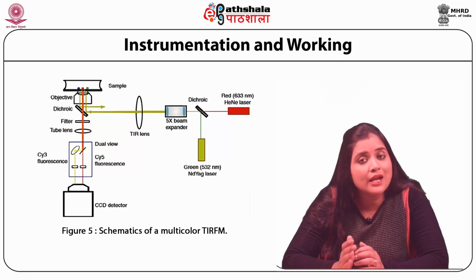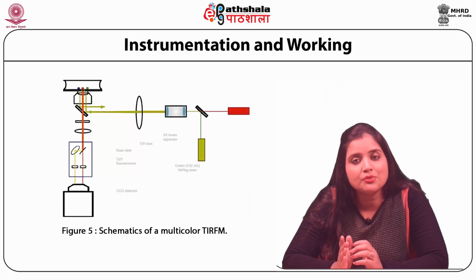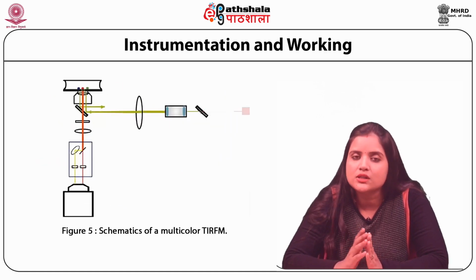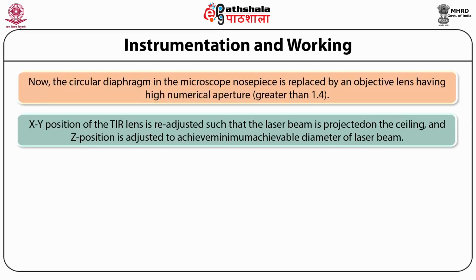Moreover, rate and extent of enzyme reactions can be determined by using conjugates of fluorochromes whose fluorescence is changed by activities of enzymes.